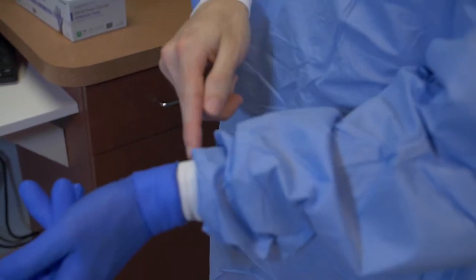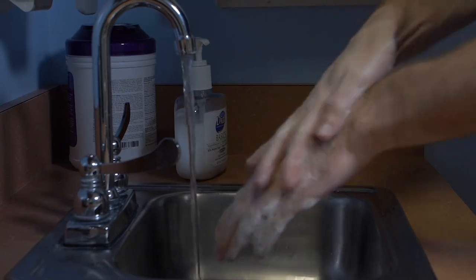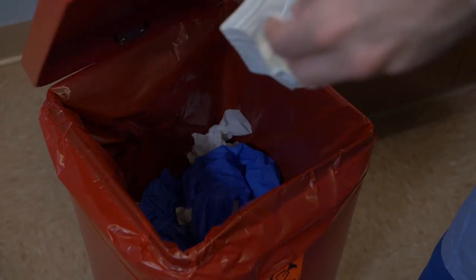To dispose of these protective barriers, remove the contaminated gloves first and wash your hands. Remove the mask from your face holding the ties securely, then discard the mask in the proper receptacle.